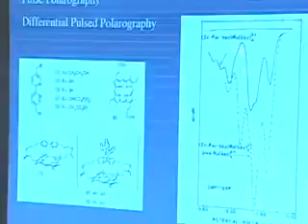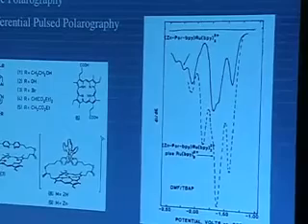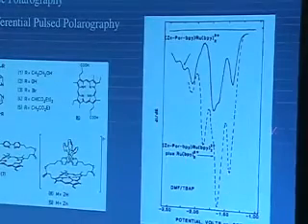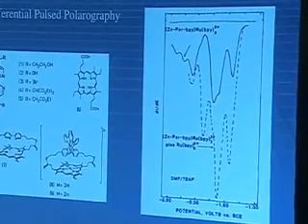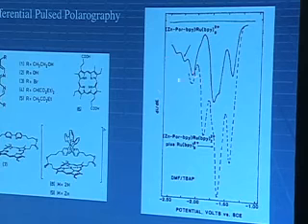So what happens here? So we got this solid curve out, which is a kind of complicated looking thing, you'll notice, when we ran this on this complicated looking molecule. And then we simply threw in a little bit of ruthenium tris bipyridine, spiked the solution with that, and you observe when you do that, that these three waves right here, there's a little bit of movement, bounce up, but nothing's happening over here. This one, you can see there's a little change in the baseline, and similar for these, although we didn't show it.